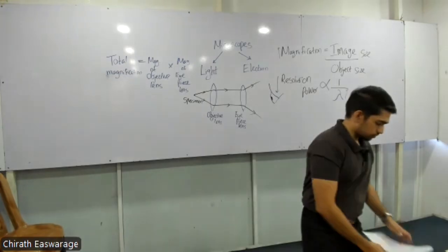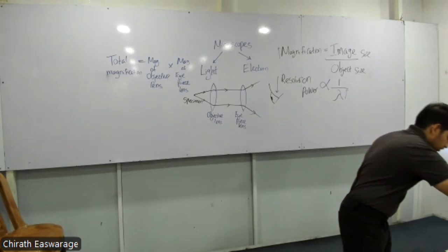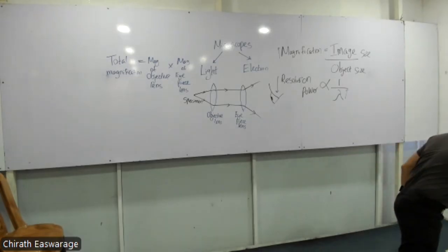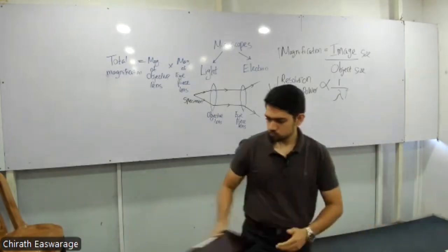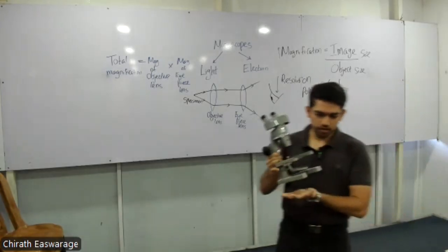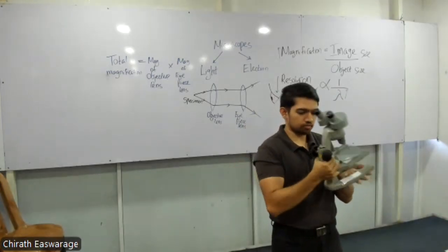Okay, let's come to showing you the microscope itself, right? So don't laugh at my microscope. So the basic thing, one of the simplest things that you need to know before touching a microscope is how you handle it, right? You have to hold it like this, right?